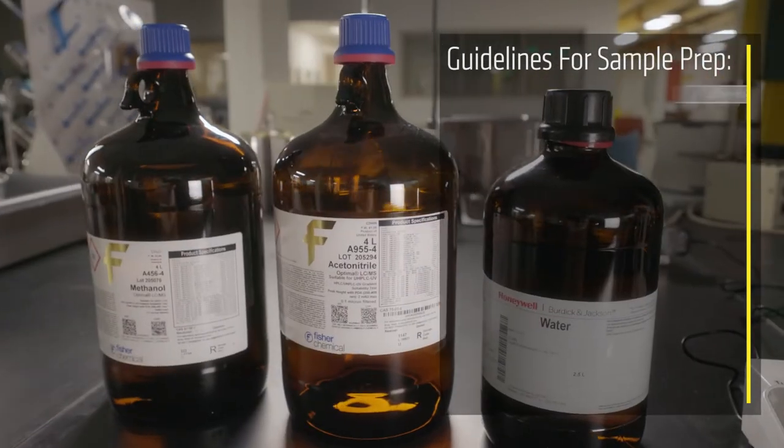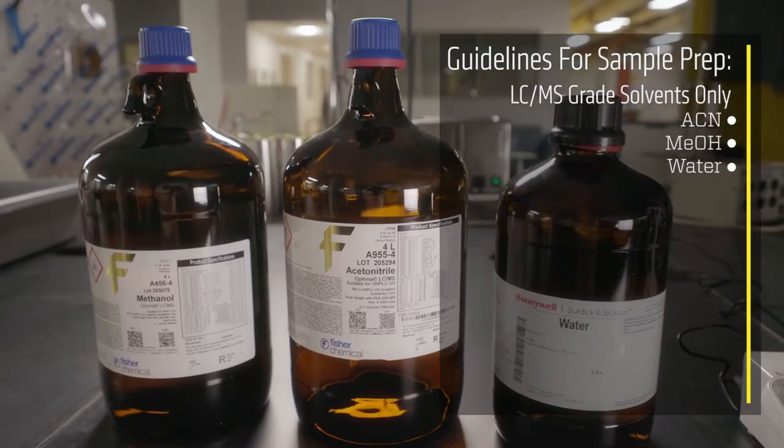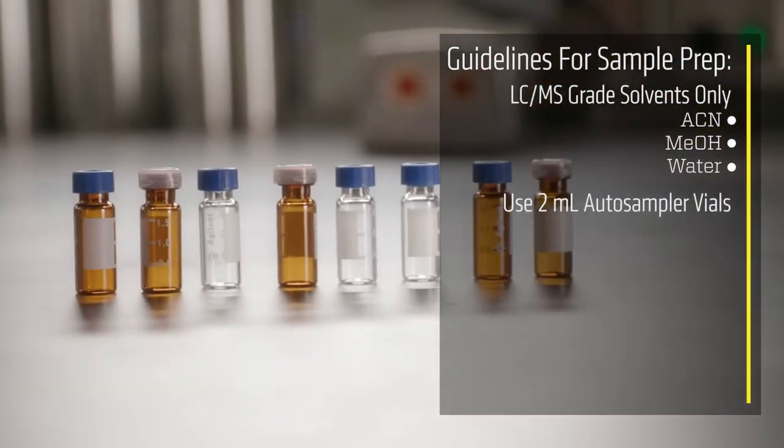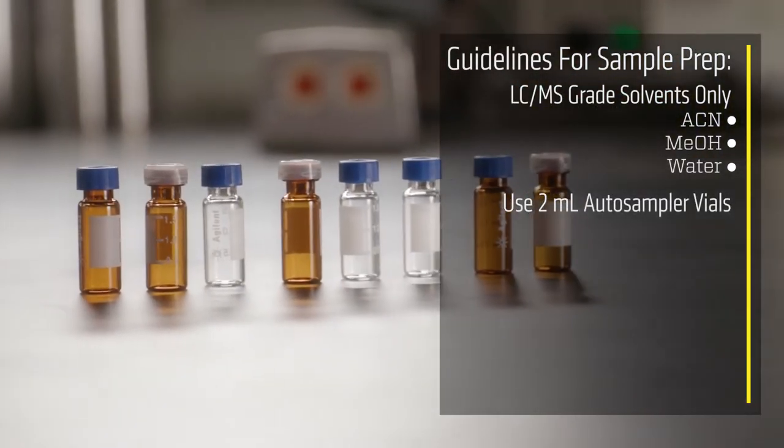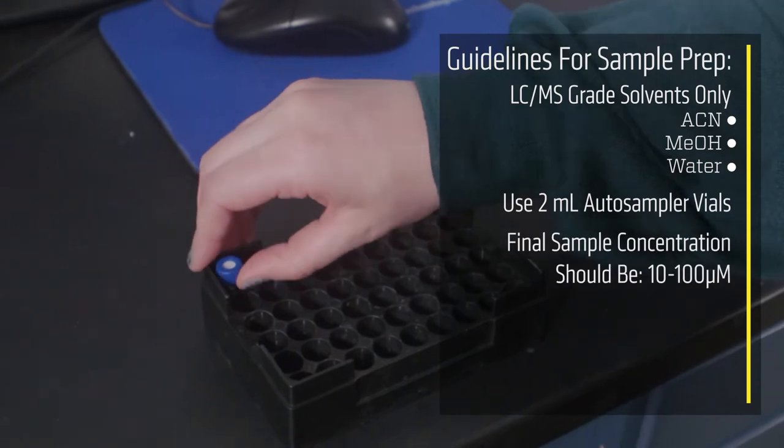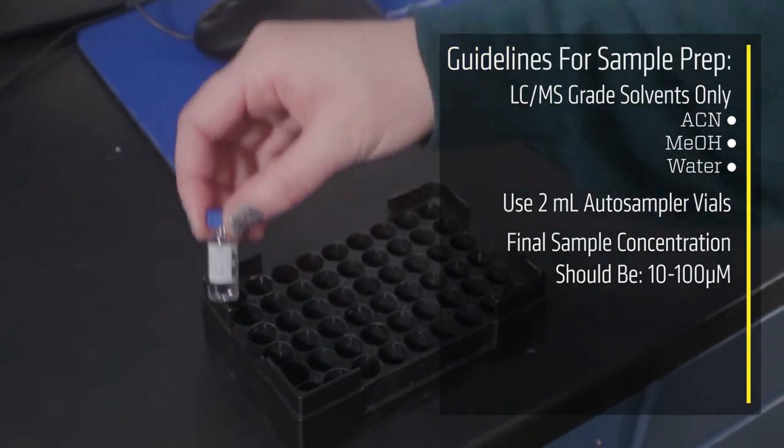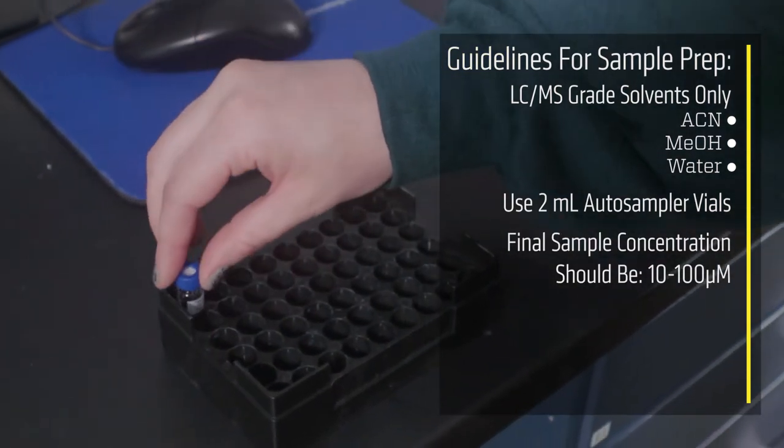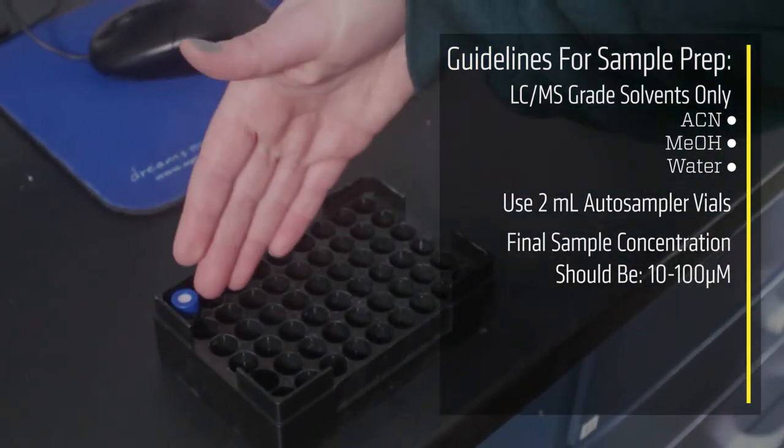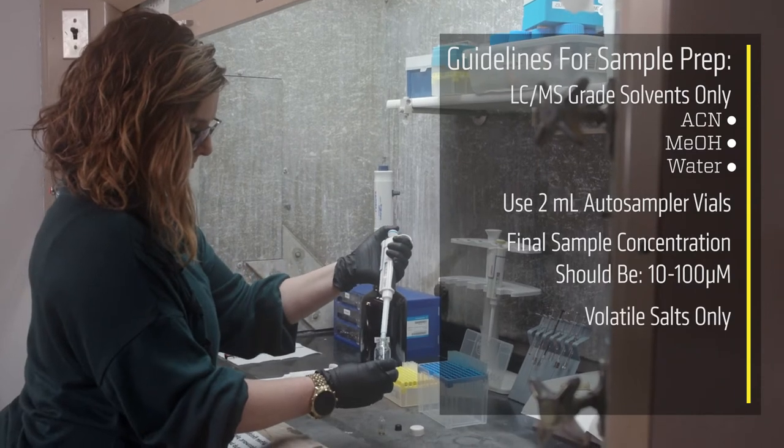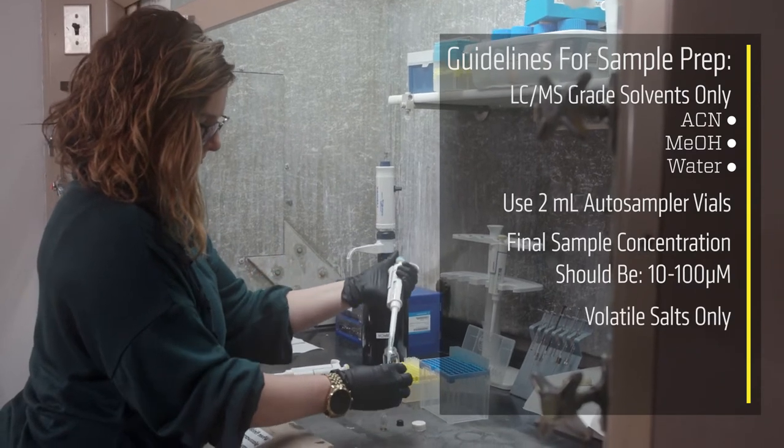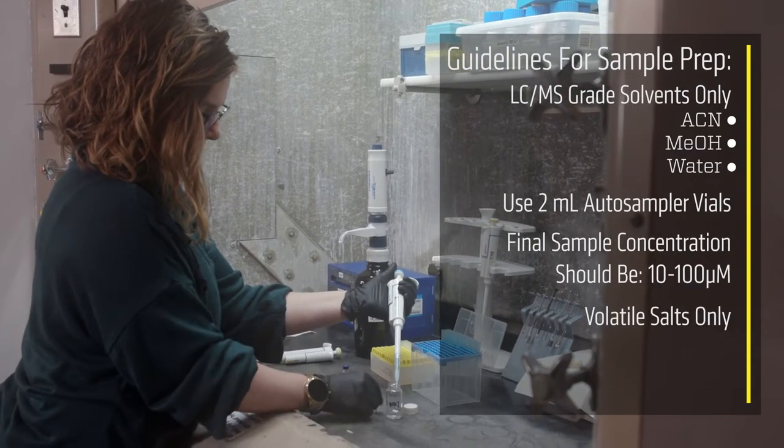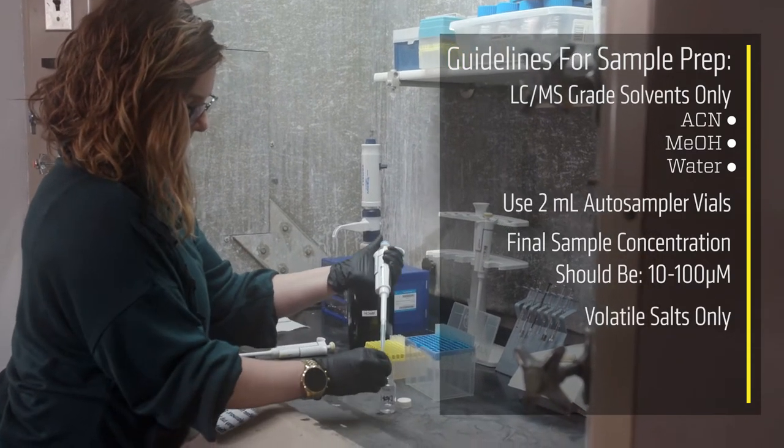Here are some important guidelines for sample prep: LC-MS grade solvents only. Use two milliliter autosampler vials. Final sample concentration should be between 10 and 100 micromolar. Your sample should not include salts unless they are volatile. Phosphate buffered samples must be purified.